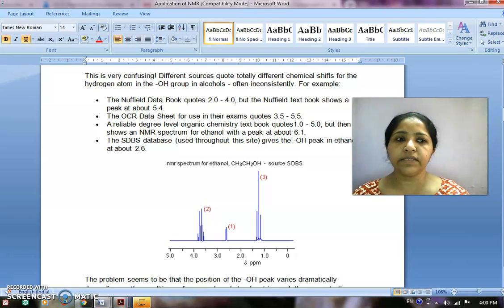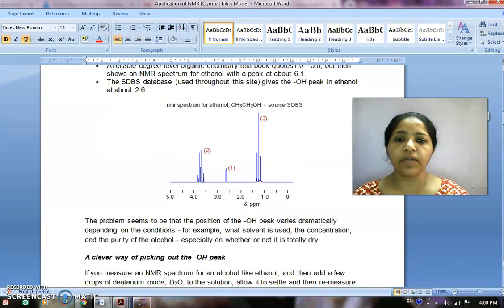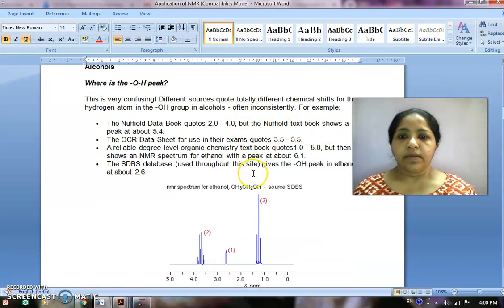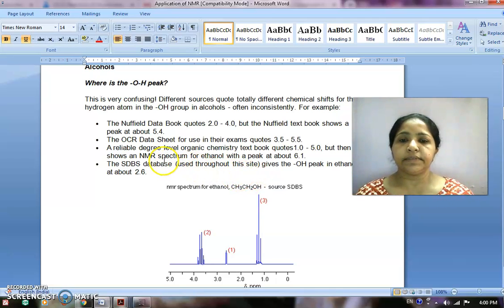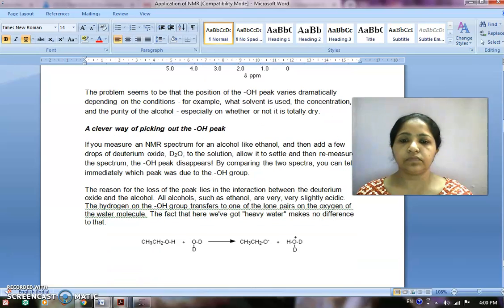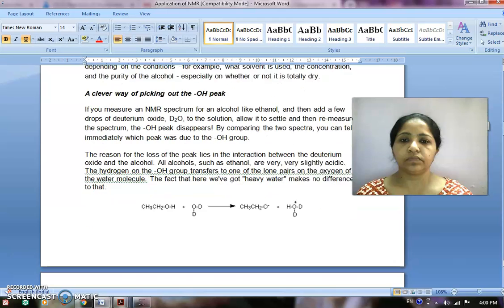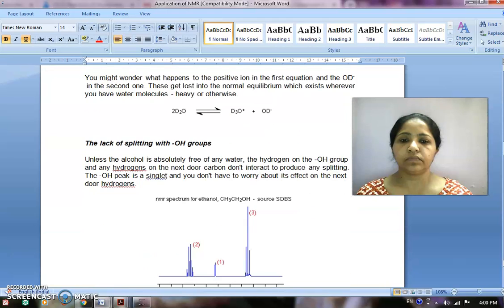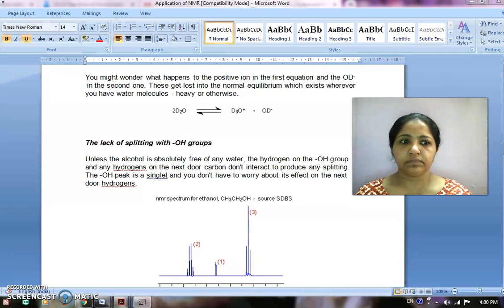Now what we can correlate from this is that this OH, let us see this.